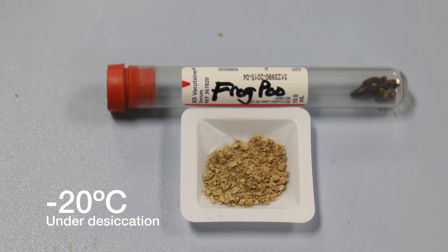If you're gathering samples over time, the dried sample makes an excellent stopping point. The stability of the steroid in the dried sample is very good and will not change. Just store dried samples at minus 20 degrees centigrade under desiccation if possible.